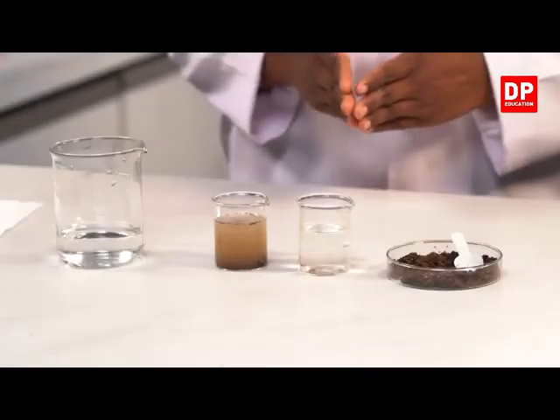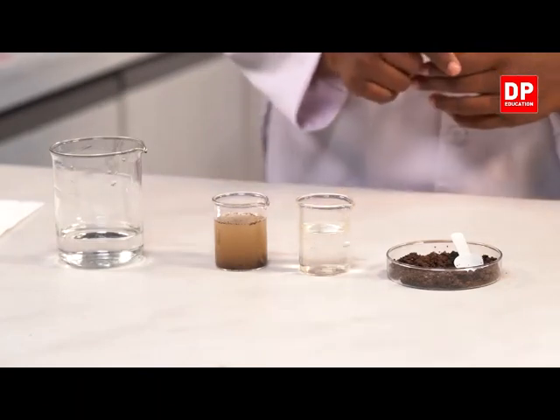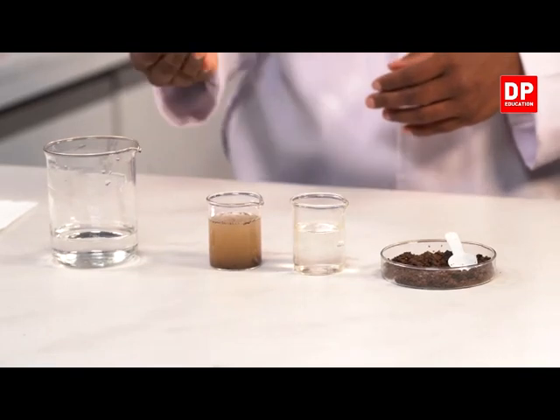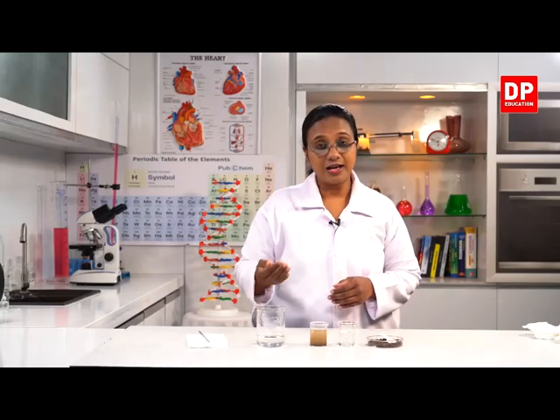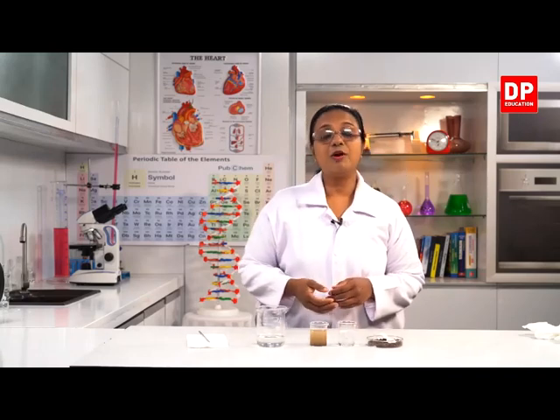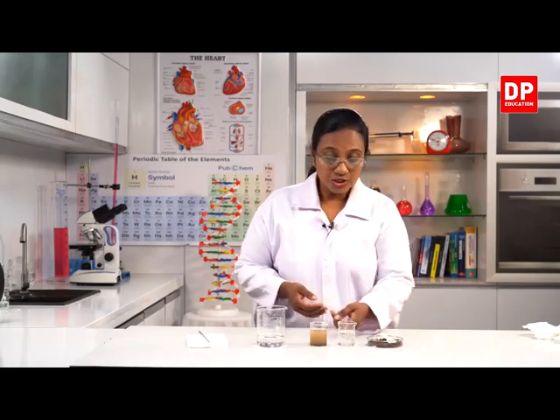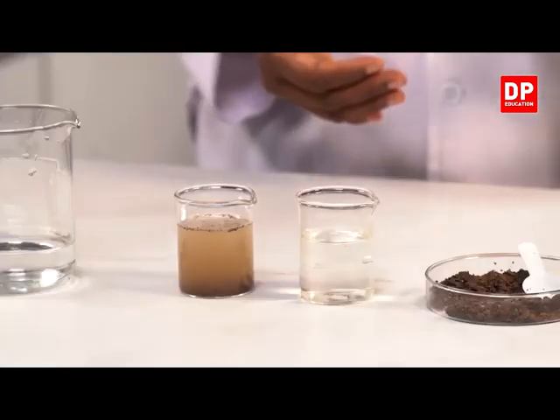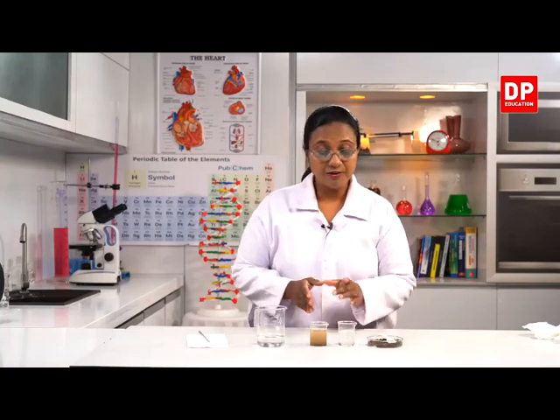Okay, students. Now can you all observe the nature of the clay water mixture? Can you all see the difference in color? At the top, it's a lighter brown in color, whereas towards the middle of the solution, the color gets darker, and at the bottom it's even darker, and you can also observe solid components deposited at the bottom. That is completely different from the first solution, the salt solution.